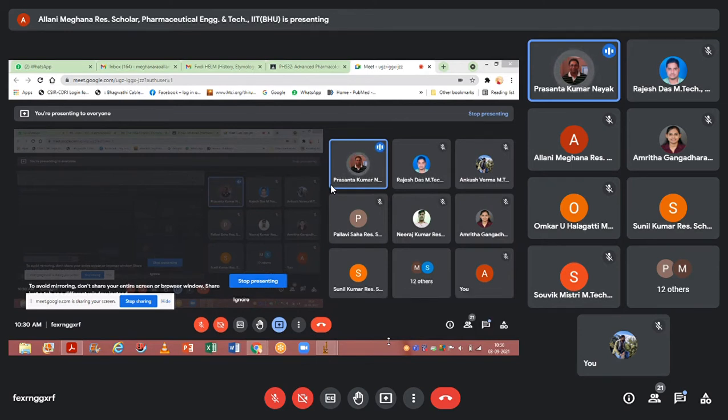So you keep that higher threshold at the same value in all other images where you may see some artifacts because of interaction with other cells and tissues. You keep the threshold the same. So you may lose some data from the treatment and other interventions, but it will be an equal loss everywhere. But if you don't do that, it will be biased. Can you hear me?